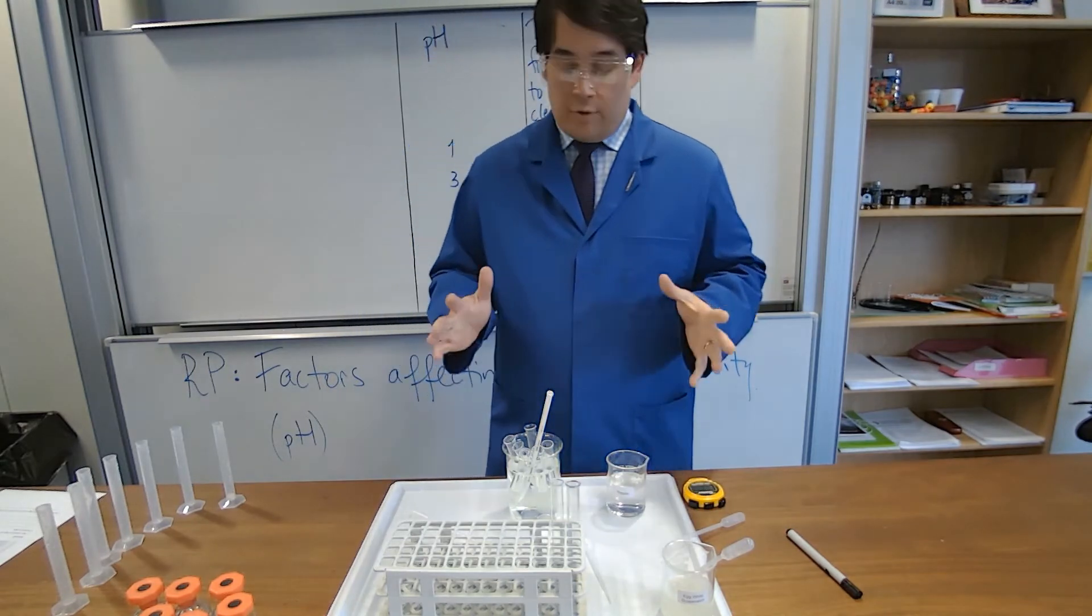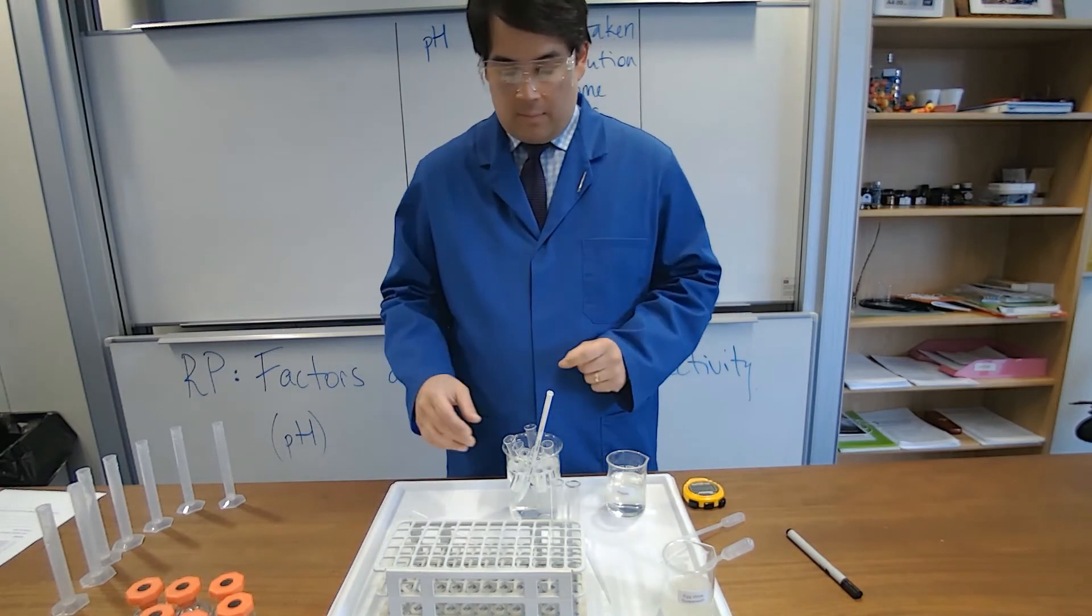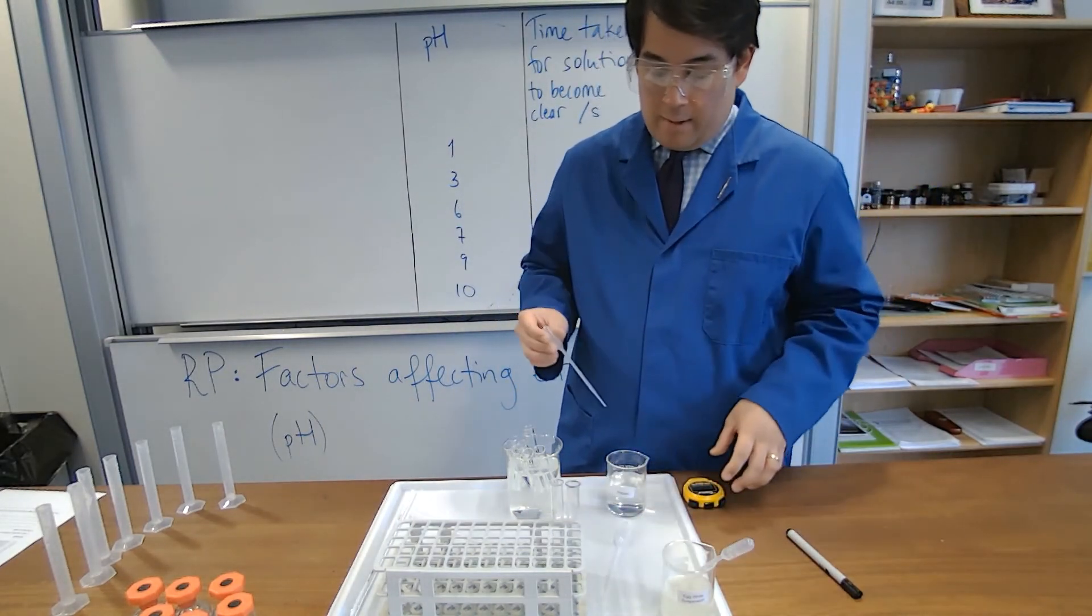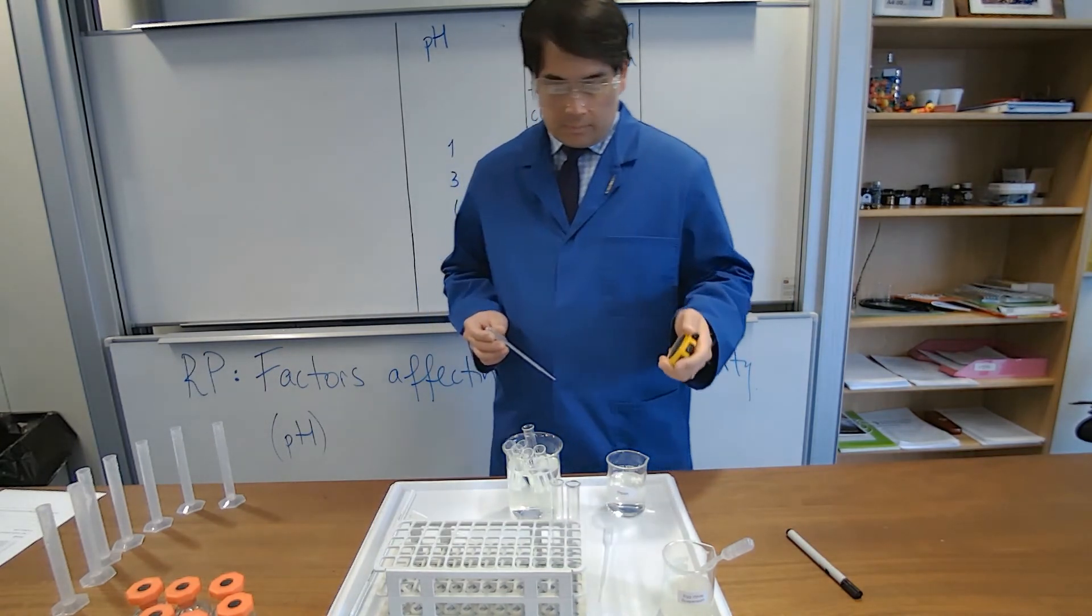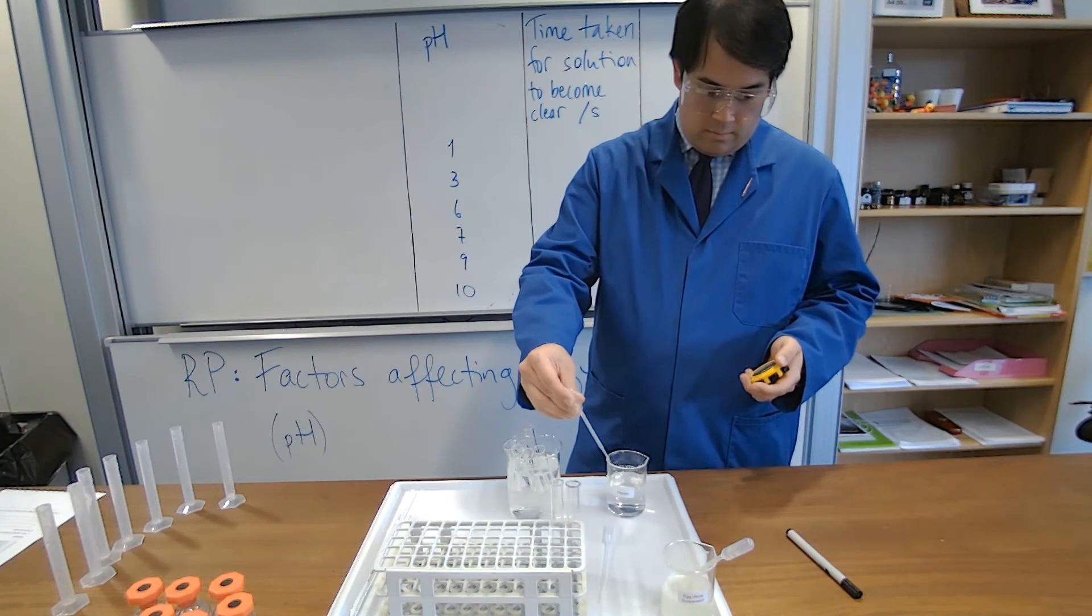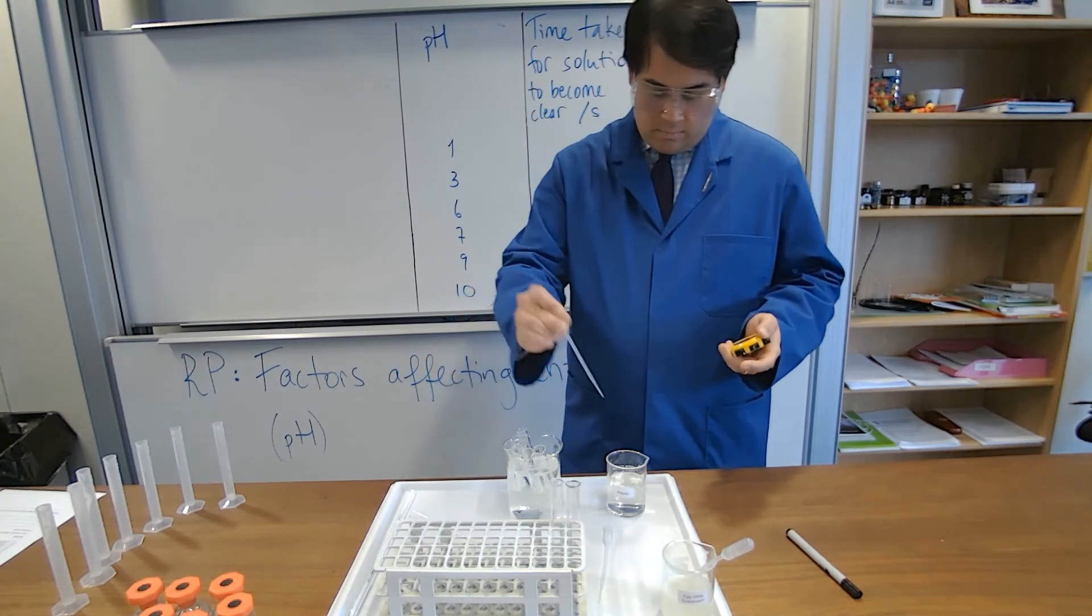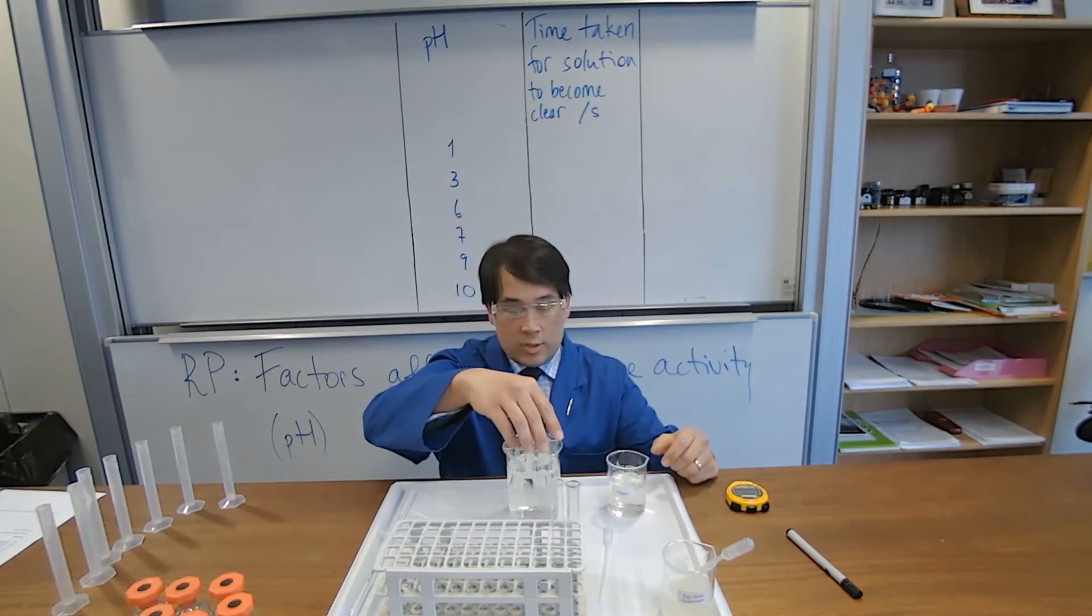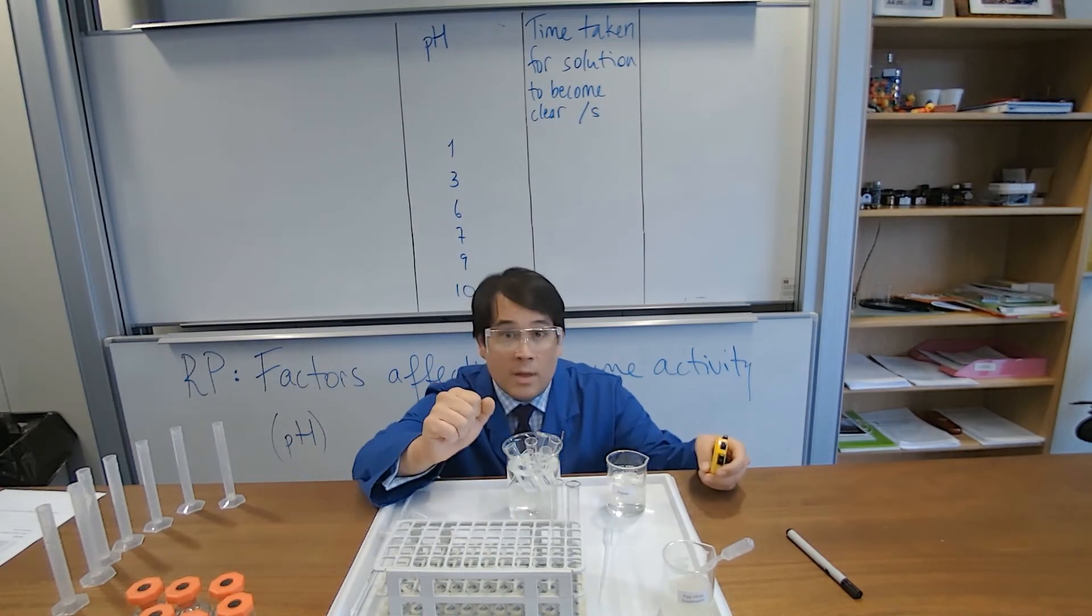Alright, so those have now been in there for a few minutes, two to three minutes, just to acclimatize. They are all of the same temperature. Now, let's crack on with our pepsin. So here's my pepsin. I'm going to put one milliliter into each one and then I'm going to start the timer. I'm going to look to see which one turns clear and then I will put the time on. Results coming soon.